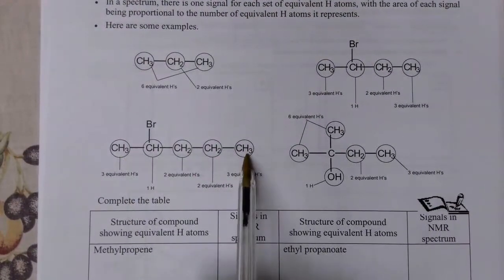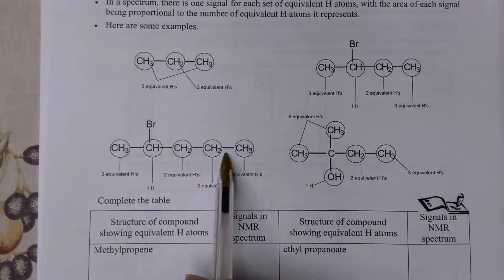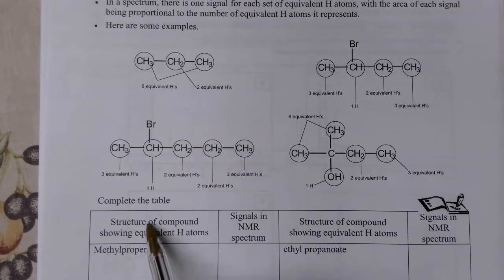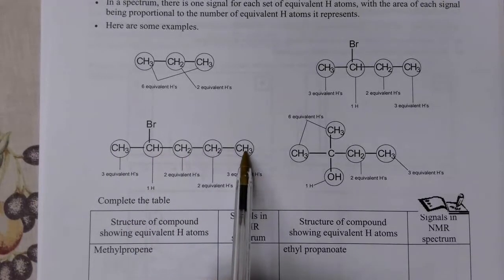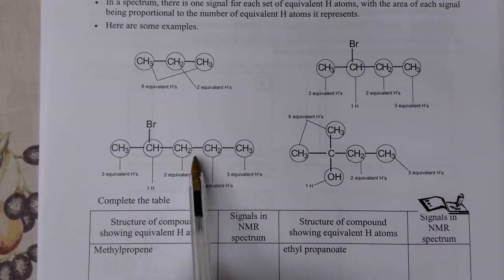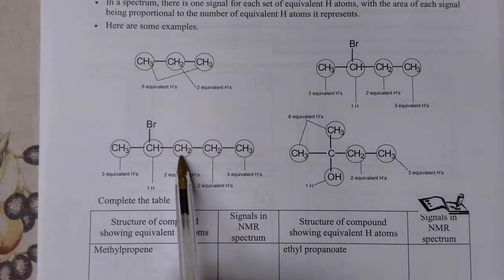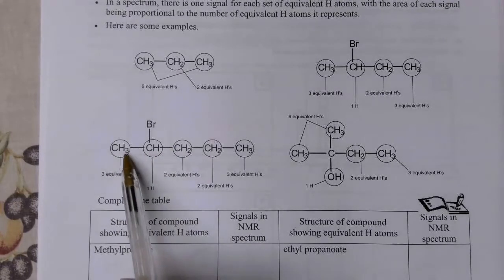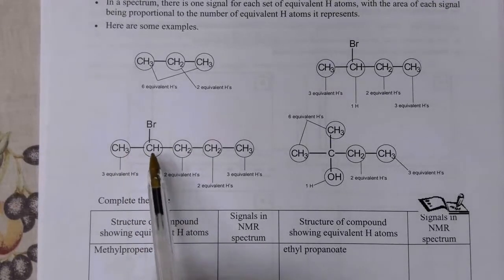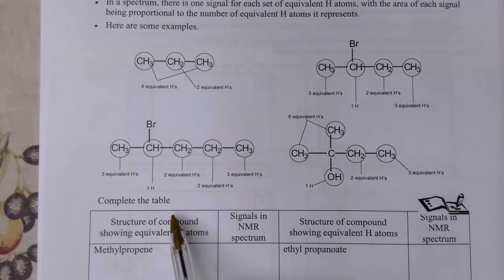Again, another molecule here. This one's a little bit more complex. Again, I have all of my hydrogens in different environments. So I've got 1, 2, 3, 4, 5 hydrogen environments. These two CH2 groups will be very close, but they won't be identical because they're not in an identical environment. You have to look along the molecule. If you have an identical environment, then it will be one signal, but if they're different from each other, it will be two different signals.